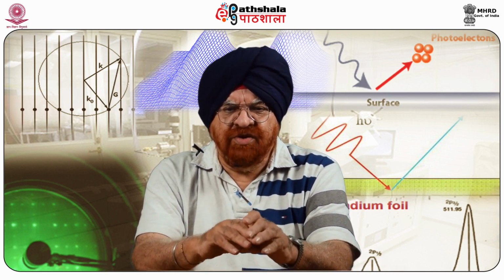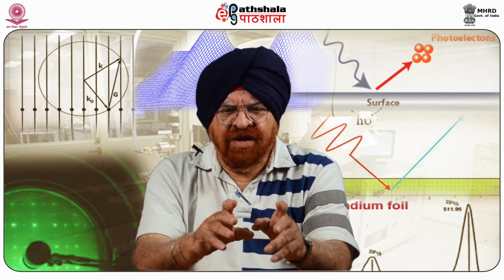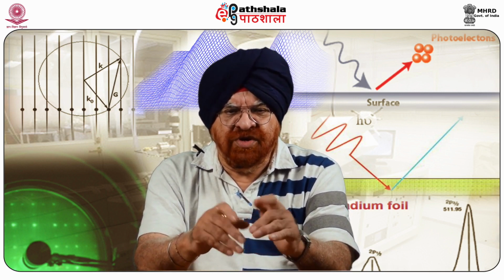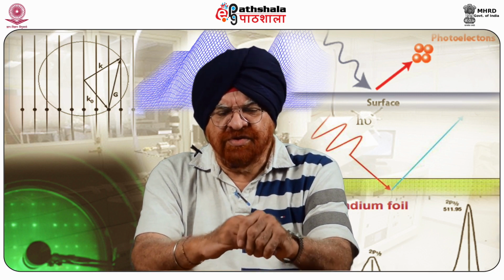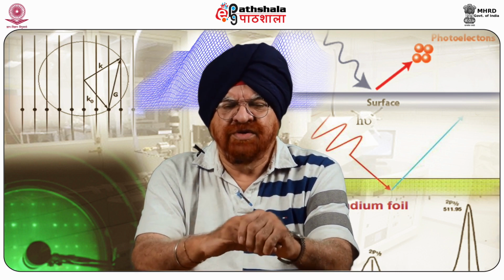Voltage is applied to the tip from the lock-in amplifier, and the reference signal voltage output is given, which is abbreviated as OSC, outgoing voltage.